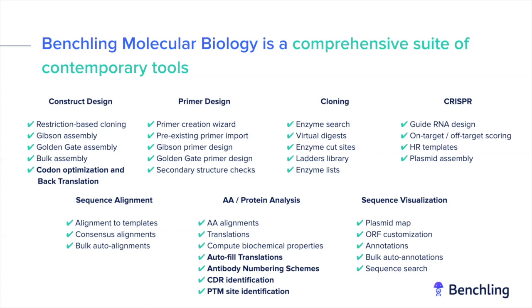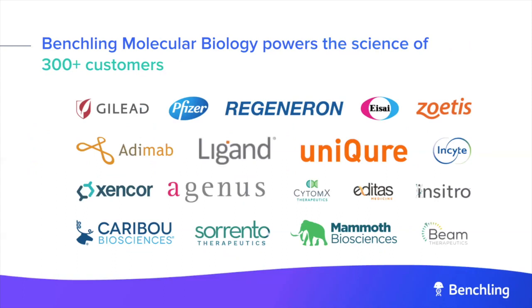But today, our molecular biology tools are already being used by hundreds of life sciences companies that span a wide variety of research verticals, from gene editing to antibody discovery to your more historically large biopharma companies. And we're proud to work with all of these hundreds of leading companies. With that, I'll pass it over to Damien, who's going to be walking through a live demo of an antibody R&D use case now.